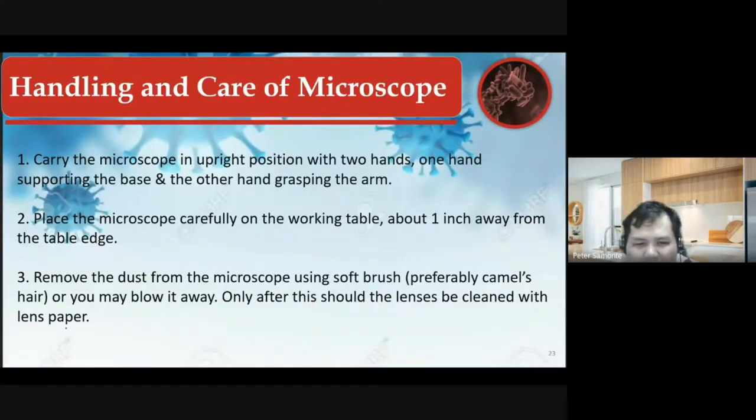That's actually, you know, in real practice, this is rarely done in the laboratory. What they would use is lens paper. And there are other laboratories, class, that do not use lens paper. They would use gauze, which is damaging and causes scratches. So, if possible, class, in the future, once you're working, try to use lens paper, because lens paper wouldn't cause scratches on your microscope.